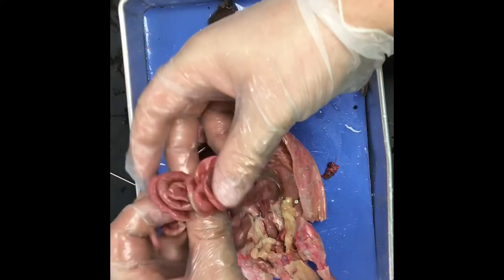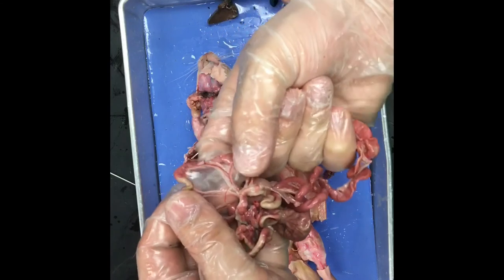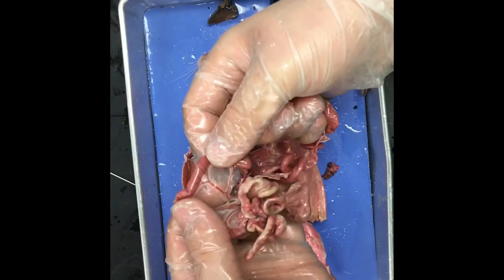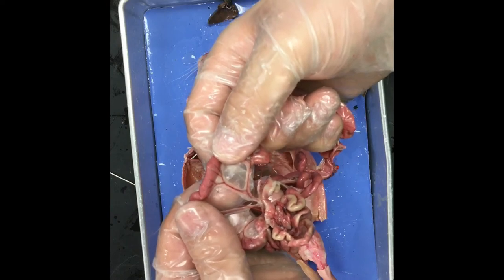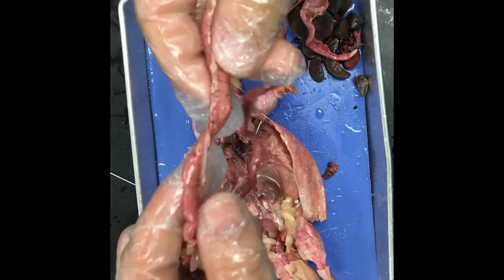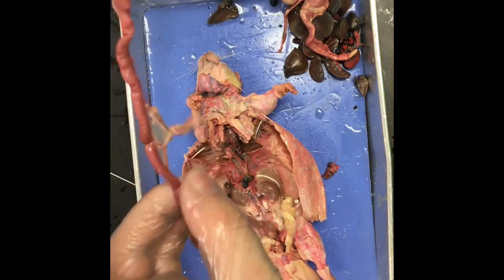Man, this guy is really fragile as far as his intestines. All right, so I'm going to open this up just a little bit. You'll notice this. What is innervating all of these small intestines? That looks like a web. Arteries. Blood supply. You're running this blood supply all through them, so that when your small intestine soaks up those nutrients, they can go directly into your bloodstream.